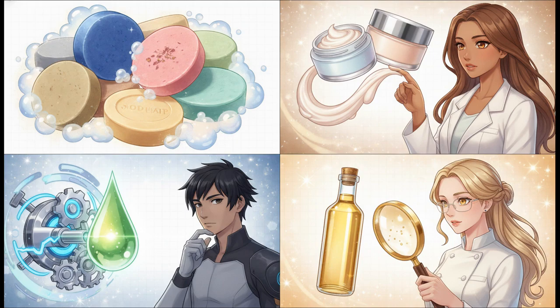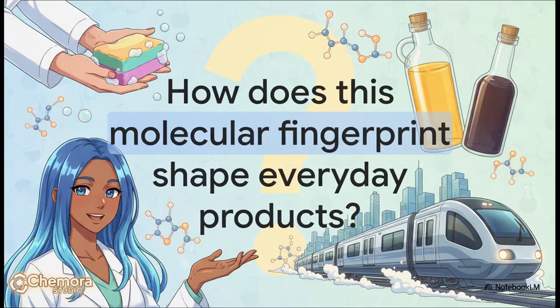And for quality control laboratories, it is a primary forensic tool. If you're a food inspector and someone is secretly cutting expensive dairy fat with a cheap long-chain vegetable oil to save a buck, that resulting lower SV immediately exposes the food fraudsters. It's chemical detective work. So the next time you look at the soaps in your bathroom, the cooking oils in your kitchen, or the biodiesel powering our transport, I want to leave you with this thought. How might knowing the molecular fingerprint of your oils actually change the products you choose to use every single day?